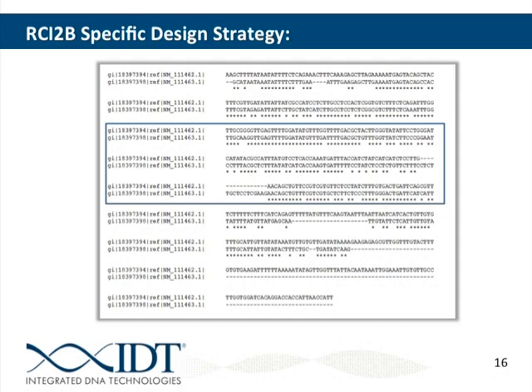So for convenience, I have that ready to go there. And now if we go to PrimerQuest and paste our sequence in.